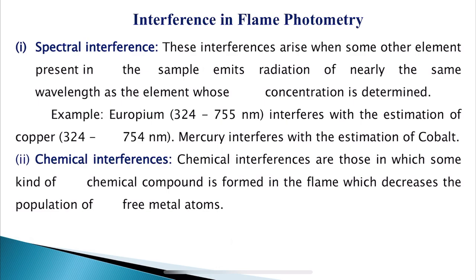For that purpose we have already purchased two flame photometry instruments, photoelectric flame photometers, which are digital. These experiments will be carried out by you practically, so you will get much more clarity regarding the flame photometric principle, how to handle it, and the procedure used to determine metal ions by using flame photometry.